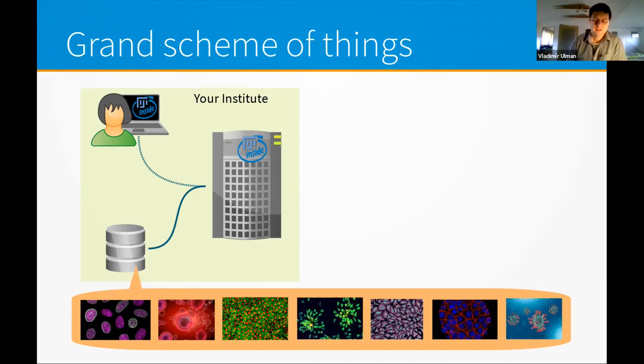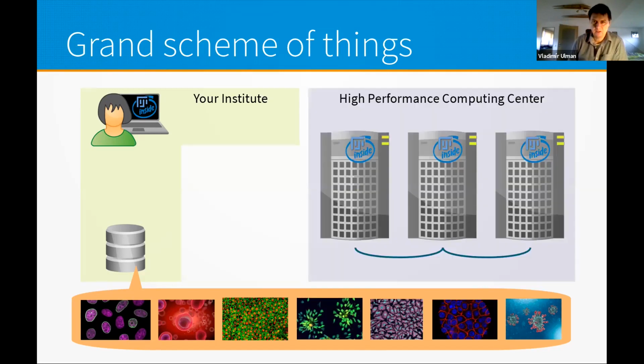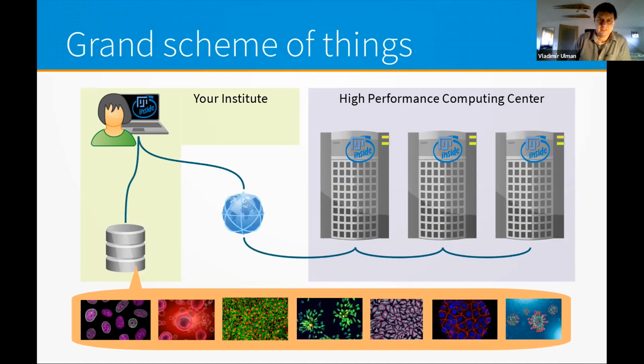You know how to do it especially, and you probably want to move a little bit beyond that, in the hope that you have some high performance computing center around you, which essentially is nothing more than a lot of powerful workstations hooked together in a network that we need to reach.